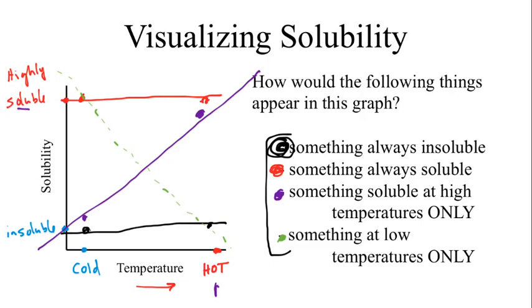Which of these curves matches that line? Well, there's only two that vary with temperature. We said the green one doesn't work, so it's got to be our purple one. So that would be our target compound, what we would want to happen. Or our target solvent, our ideal target solvent relationship.